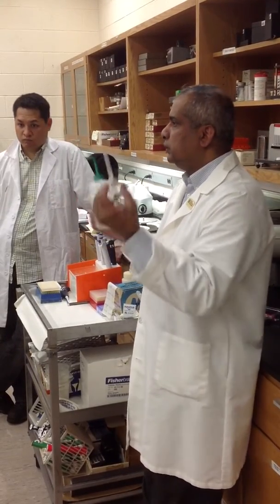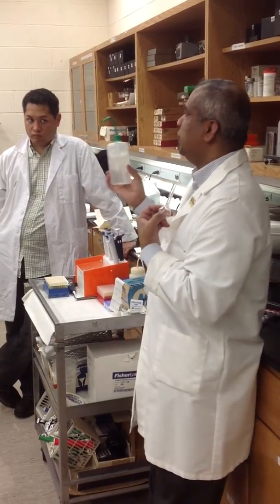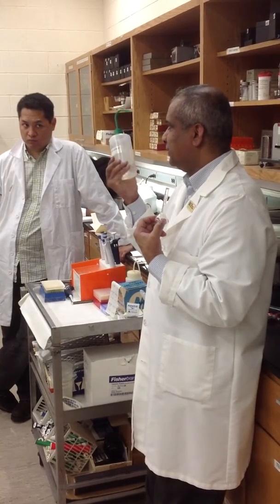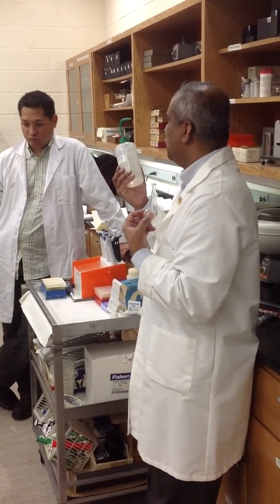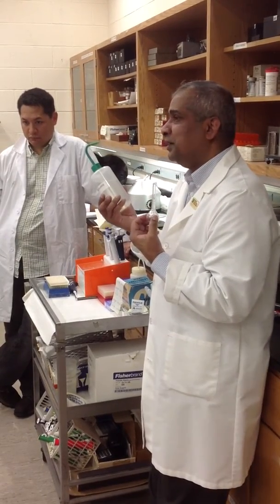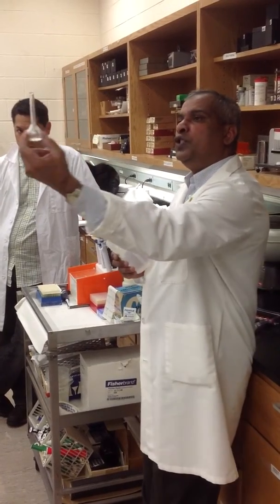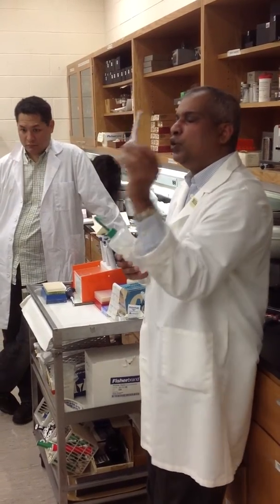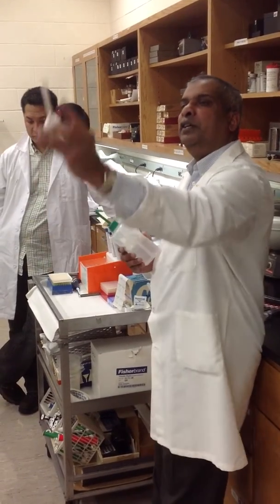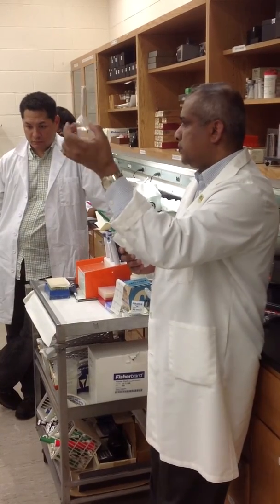So you have to make sure when you do your dilution, and you will all do this, that you do not pick up water, or else when you load your chamber, what's going to happen when you look in there? It's not going to be anything. It's all hemolyzed. So we use a volumetric flask to do dilutions because you've got to be very accurate, and you actually fill it. You've all seen volumetrics, yes?